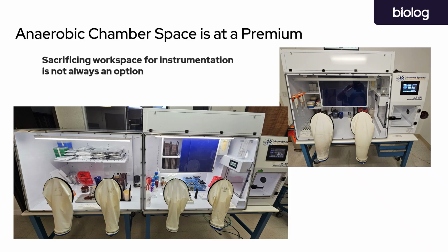One of the biggest hurdles for anaerobic chambers is space. It's critical to have all of the needed materials in the chamber so that there are always things that are pre-reduced, ready to go when you need them. This presents an issue, however, when it comes to bringing equipment into the chamber. Space is always at a premium with anaerobic chambers, and sacrifices must be made, which means that anaerobes need to be subjected to sojourns out into the air to be handled in large equipment before being brought back into the chamber, which can jeopardize viability and reliability of your data.